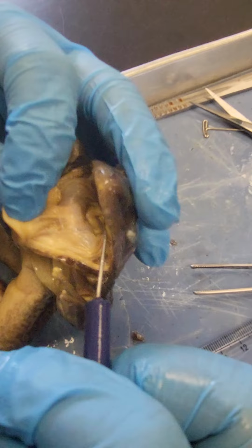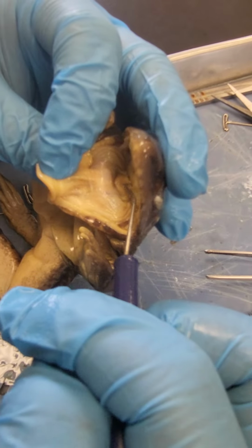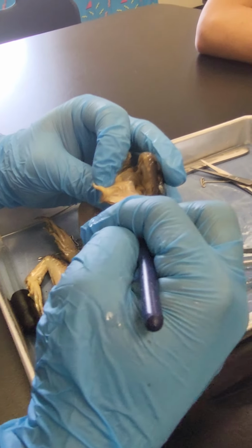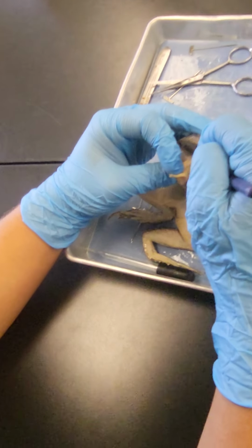It's a female because it's the bigger frog. Females are bigger than males. Evan, I found the slit. This is a female. Okay. Just write something about that, I guess. Use the probe to open the glottis and compare it to the esophagus.